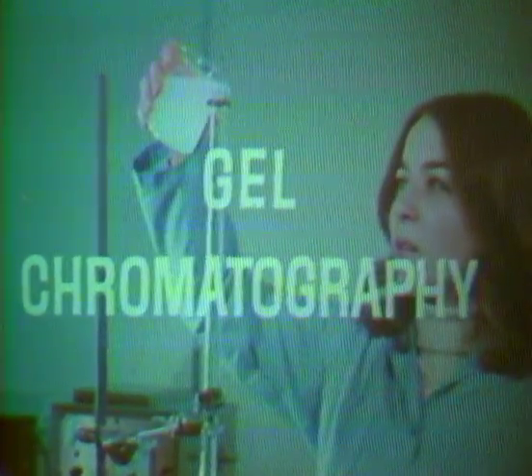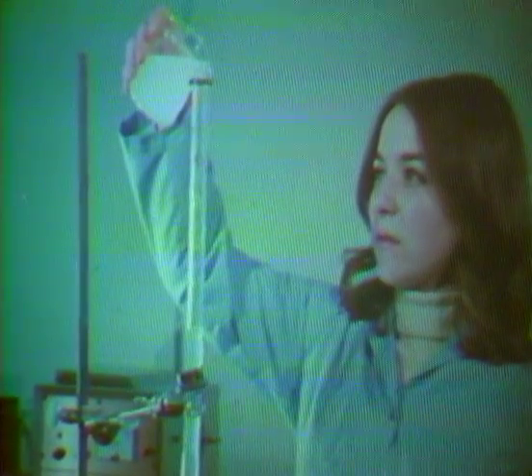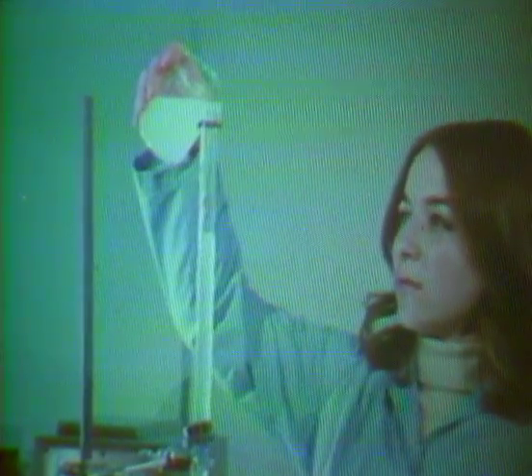The last variant of liquid column chromatography is gel chromatography, also called gel permeation or gel filtration chromatography. Here, the stationary phase is a gel consisting of a three-dimensional network of cross-linked polymeric chains. The gels are insoluble in water, but swell greatly in it and have water trapped in each pore. Ideally, the gel works as a filter, screening and separating the sample components by the size of their molecules.